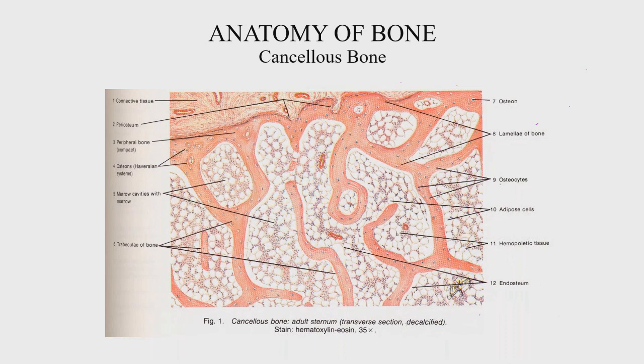So this had to be done very delicately and with a lot of care and monitoring. So I like to use this example to show across the diagram. You see number 6, you see the trabecular bones. These are thin, almost like peninsulas or islands running through the bone marrow. And once again, a good way to distinguish whether you have optimal decalcification is to look at those cells within this bone and see if they're still exhibiting good nuclear staining.